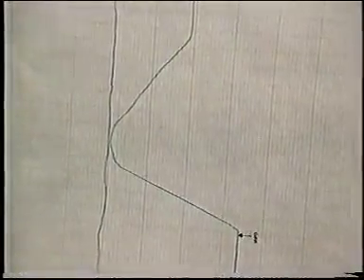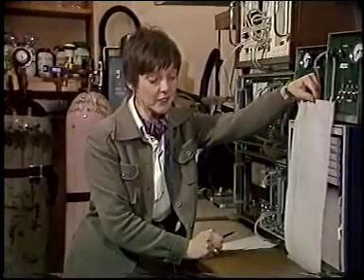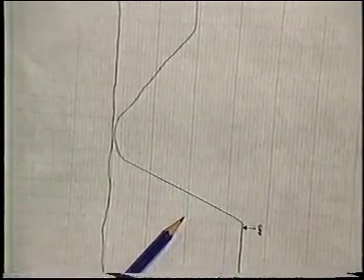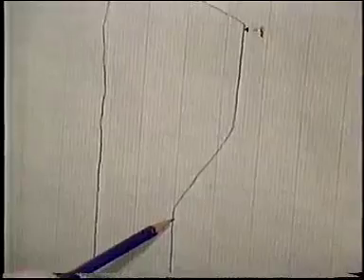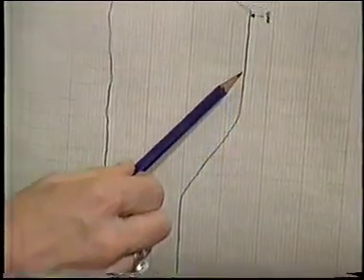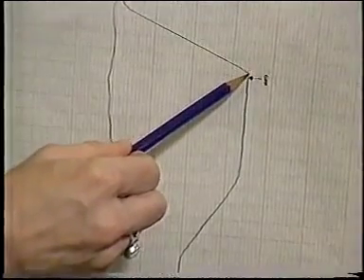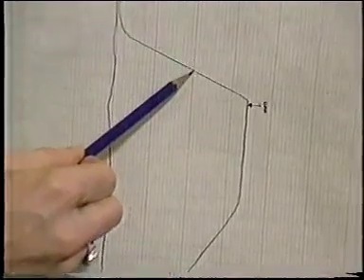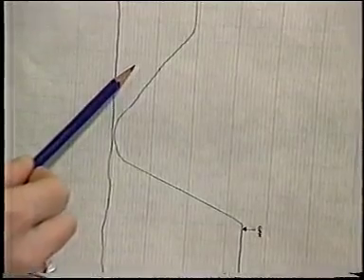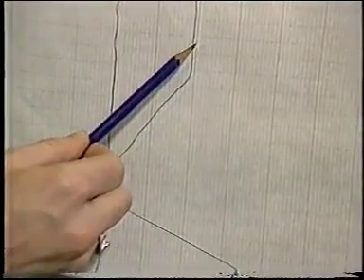The second clue relates to this blip on the CO2 recording from the gas analyzer, the IRGA. Remembering that the midline here indicates there's no net efflux or influx of CO2, if we go back to the beginning of the chart, when the leaf was put into the chamber, first of all, in the light, there is an uptake of CO2. It attains a steady state of photosynthesis. But here we switch the light off, and of course photosynthesis stops. There's an immediate drop. We pass the midline, so we're now looking at something like respiration. The rate of respiration tails off until back here there's only a very low basal rate of respiration.